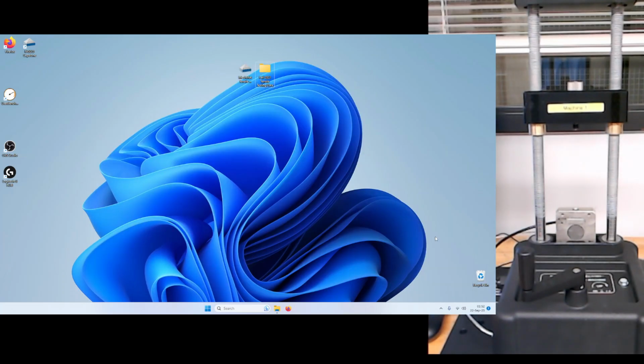Welcome to our video on using the material testing machine for mechanics and materials. We're going to use a PASCO ME-8236 machine to be able to characterize some of the mechanical properties or material properties we've been discussing in class.